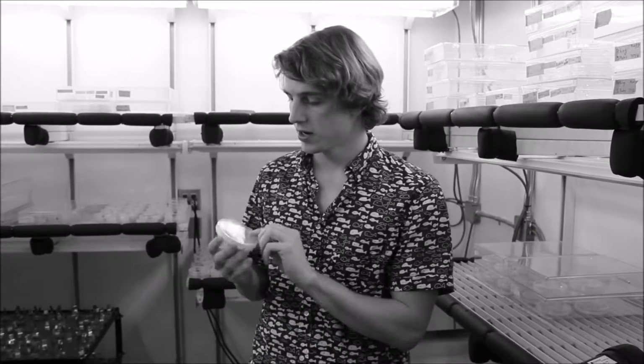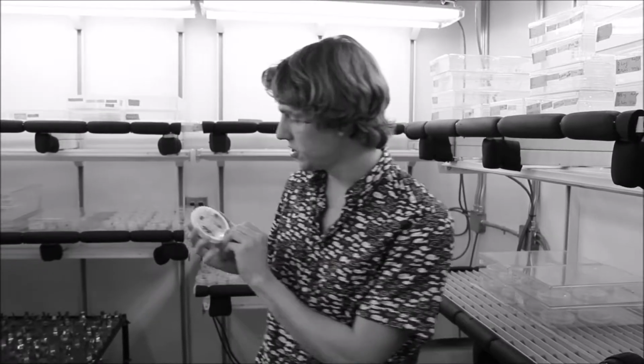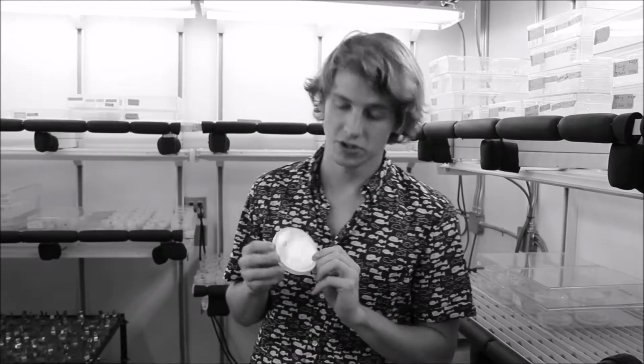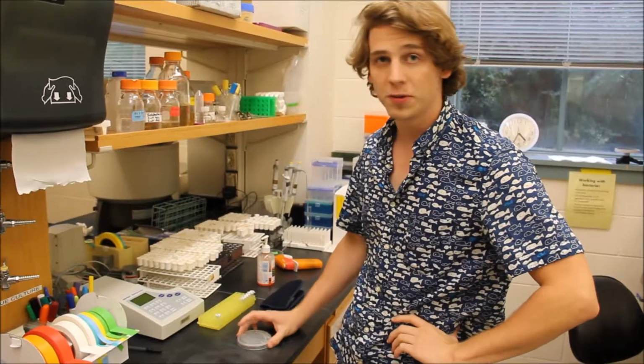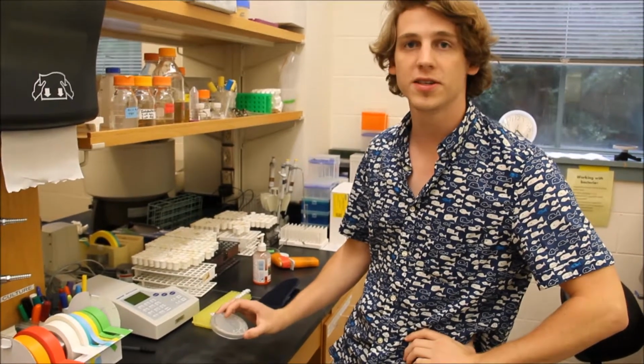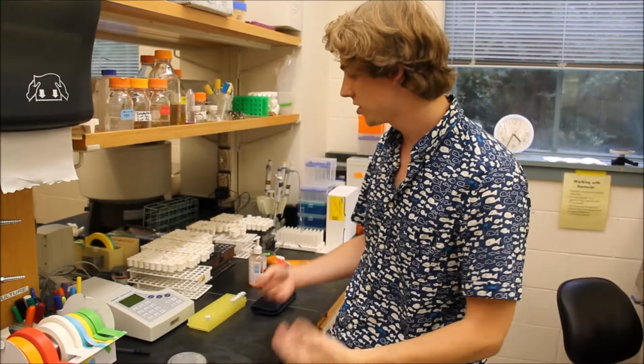Hi everybody, welcome back. So after 3 days in the dark room and 3 days in the light room, our beans start sprouting. And once undergoing germination and reaching this stage, they are ready for Agrobacterium transformation. So for proper hairy root transformation, one important step is to grow your Agrobacterium that you will infect with 2 days before you plan to actually infect your germinated seeds.